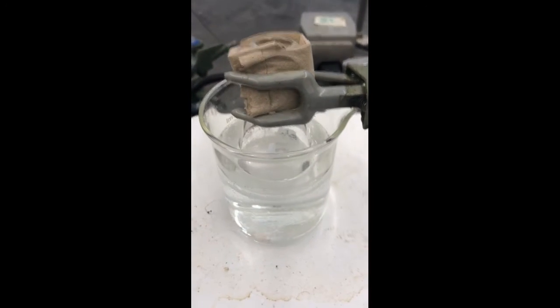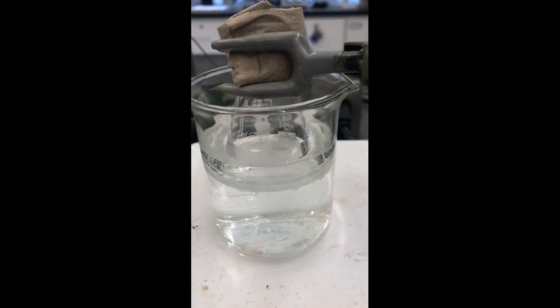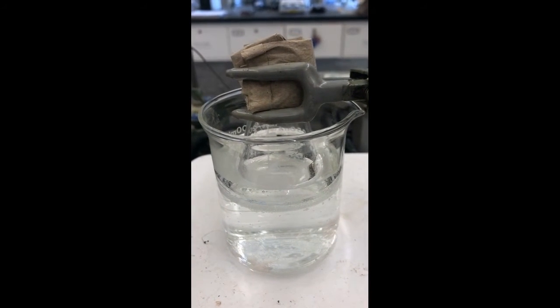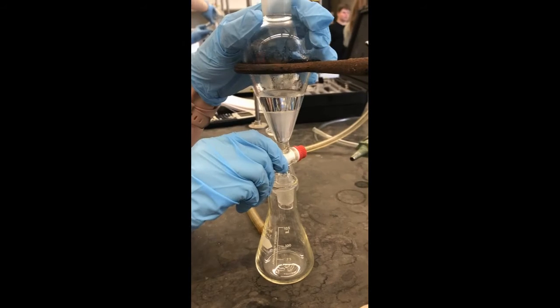After the hydrogen gas ceased being produced, the mixture was heated to a boiling point, then cooled to room temperature. The contents in the flask were transferred to a separatory funnel and the previous flask washed with 15 milliliters of diethyl ether and added to the mixture in the separatory funnel. The aqueous layer and the organic layer were separated into the 2 flasks.